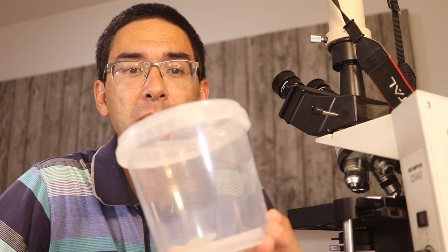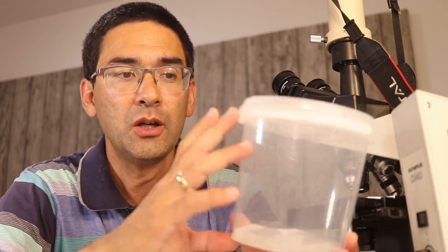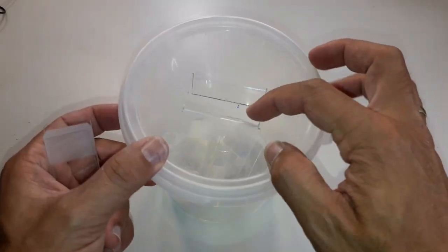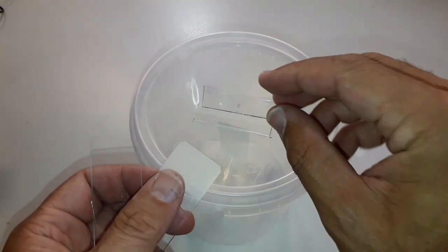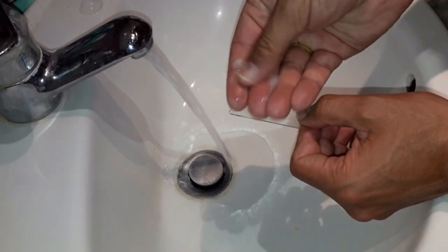Used microscope slides I collect in a plastic container like this. This is actually a candy container, but in some countries they also sell yogurt in containers like this. These are very cheap disposable containers and I've cut a little opening in the top. I simply drop the microscope slides in after use, and when the container is full I wash and sort them — damaged slides or those with chipped corners I throw away, as well as broken cover glasses.